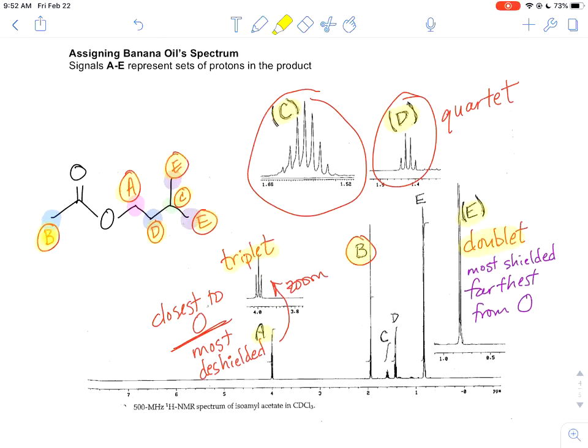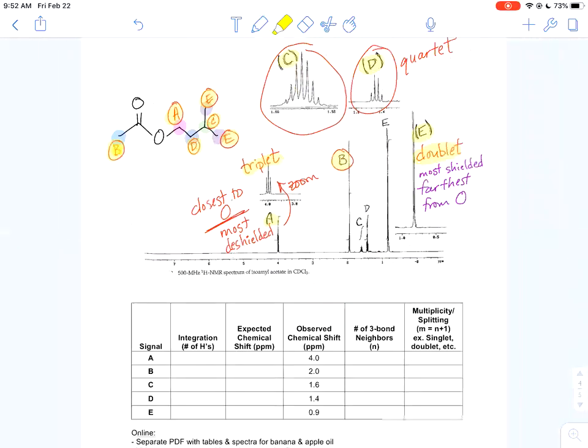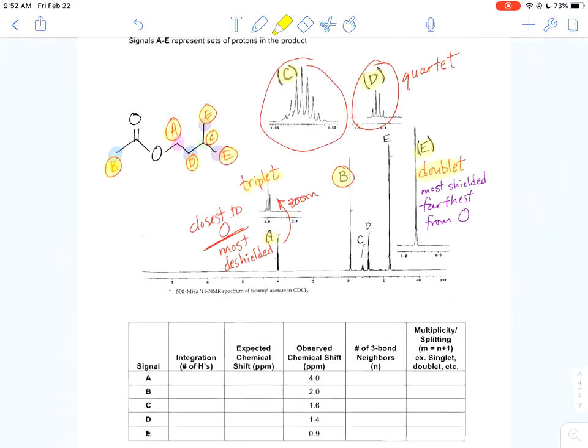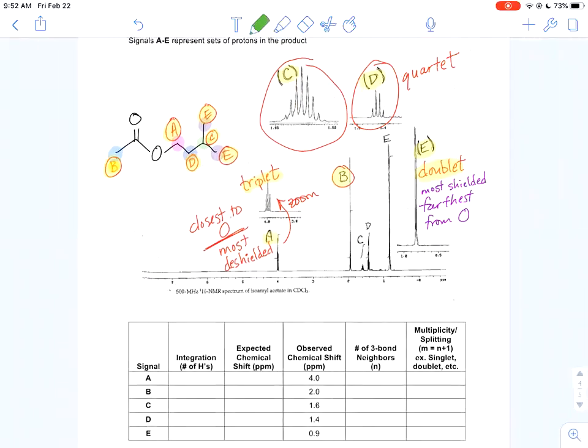Now to translate that into our tables, we're going to need a little bit more to elaborate, to fill in. I will let you all fill in the splitting and the number of neighbors part. I really want to focus on clarifying what to put for the expected chemical shift and for the integration. Let's do the chemical shift first because that's the one that you're more familiar with.